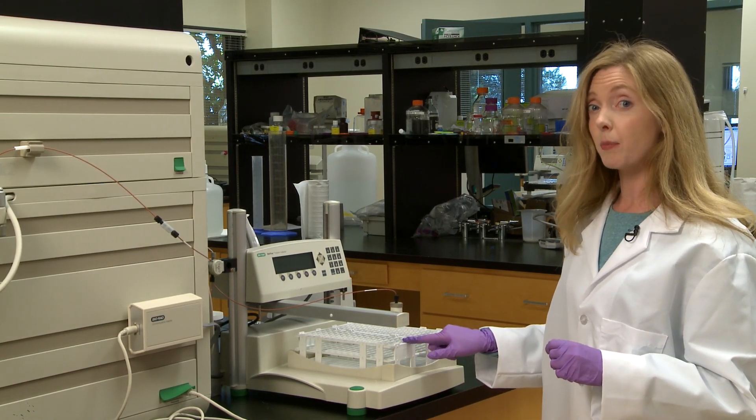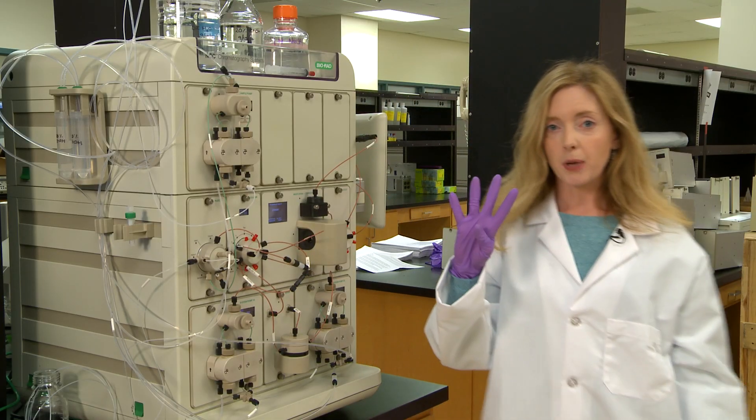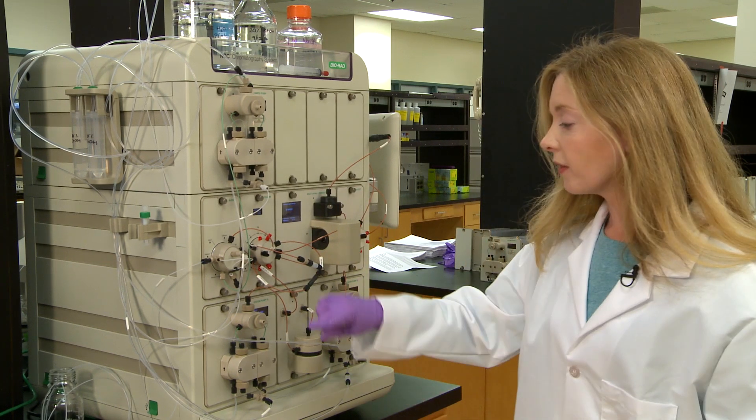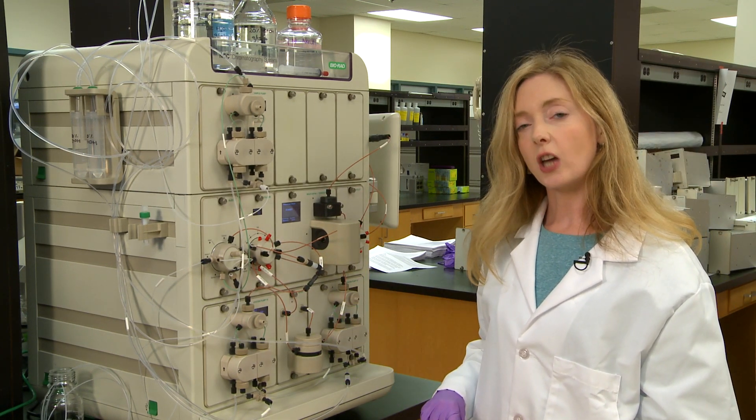You don't want anything nasty getting into your sample, especially after you've spent all that time optimizing your purification. And finally, tip number four: store all of the lines in your chromatography system in 20% ethanol at the end of each day.